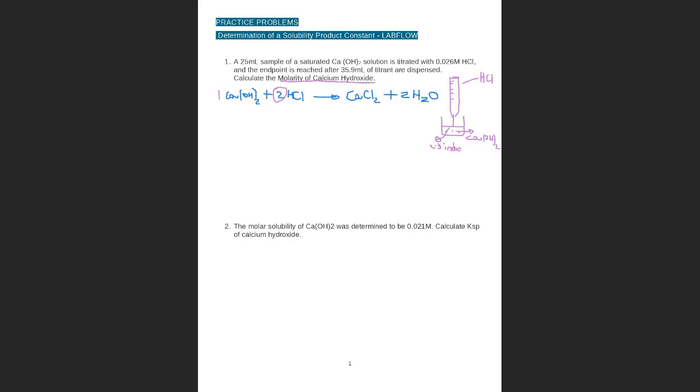Yes, thank you, excellent. Everybody says 2. Exactly, this concept is very, very important because then the calculations are simple. But you need to know what you are doing. You are titrating until the end point.